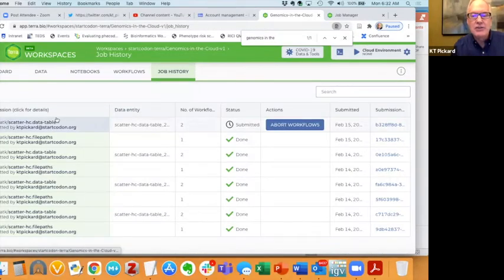We'll go back to our job history. The one that we ran just a few minutes ago is finished. This is the job that I just put through in this workspace. So that's off. I can show you a previous run of that software. I'll just grab that one.